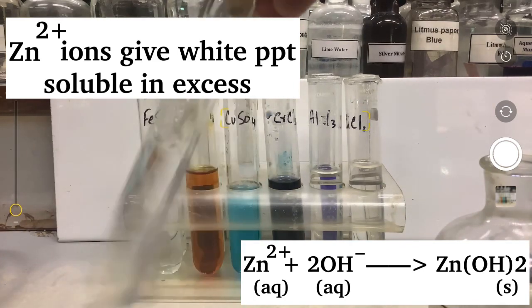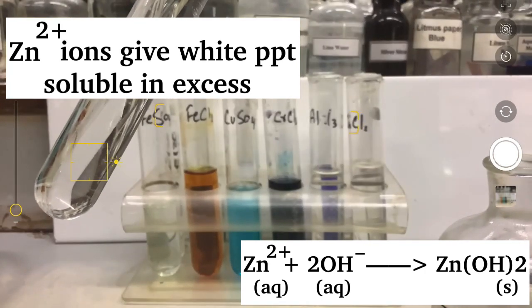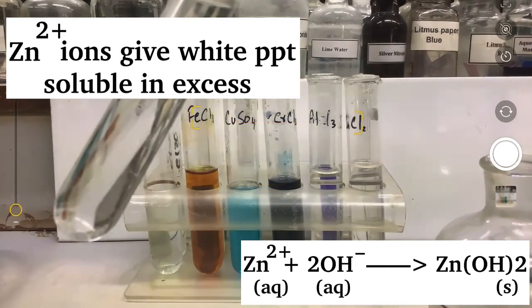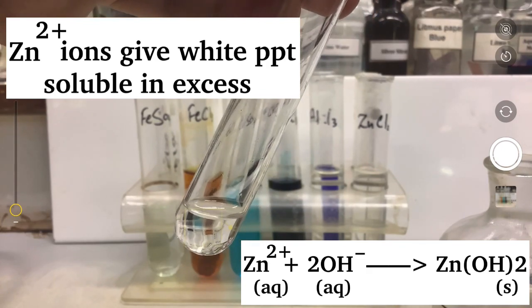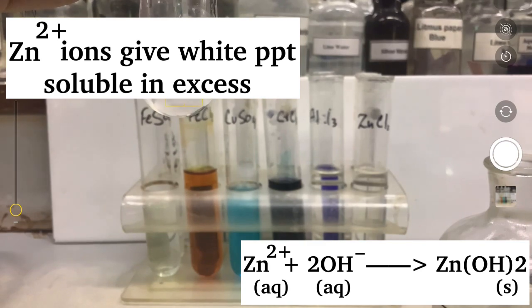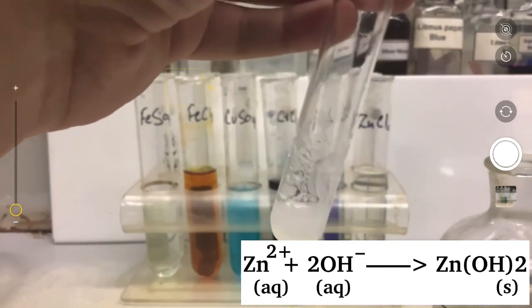So in this way, testing between aluminium and zinc becomes very difficult, because they both gave white precipitates and both white precipitates were soluble in excess sodium hydroxide. But don't worry about it, because aqueous ammonia is going to help us. When I add aqueous ammonia, it gave me white precipitates.